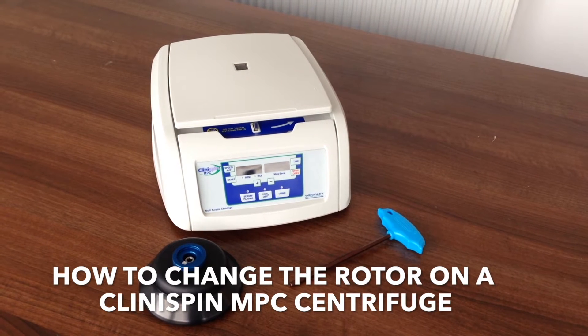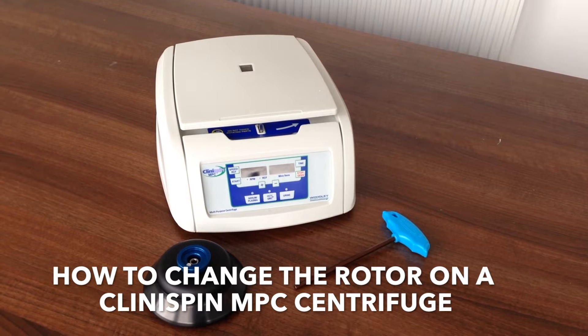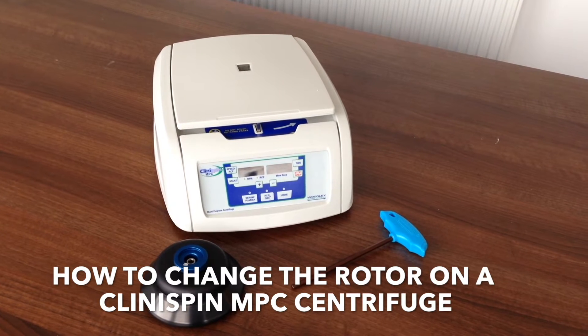Welcome to this Woodley Equipment Company instructional video in which we will demonstrate how to change the rotor on a Clinispin MPC centrifuge.